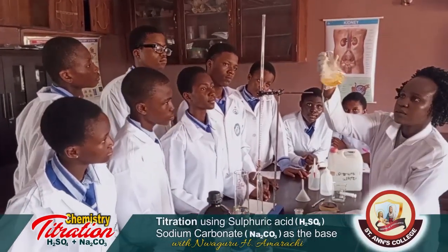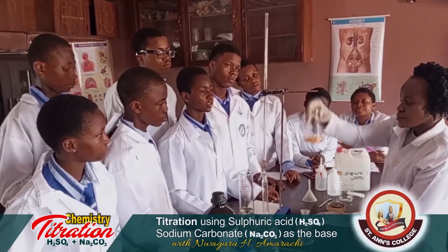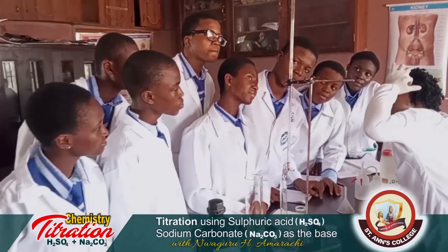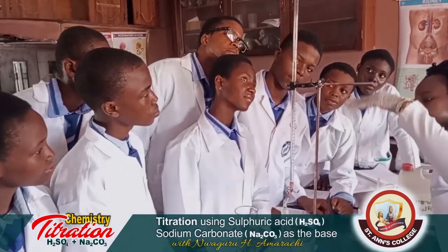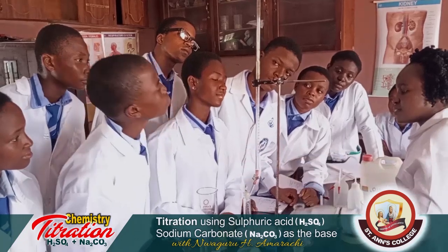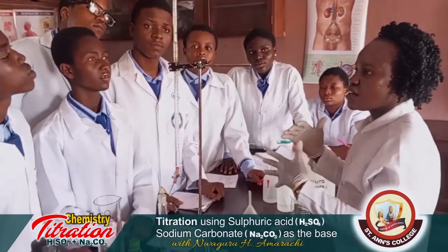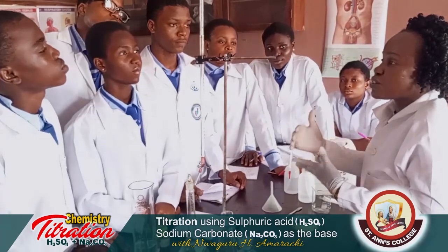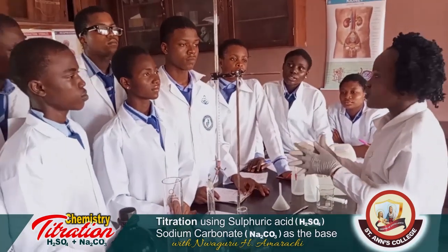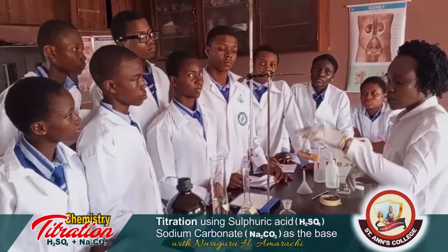I think we have a visible color change now. So let's take our reading. You can see there is a difference in the value, because the burette is already saturated with the acid. That's why we have to run it up to 3 times before we finalize, to give us a visible endpoint.